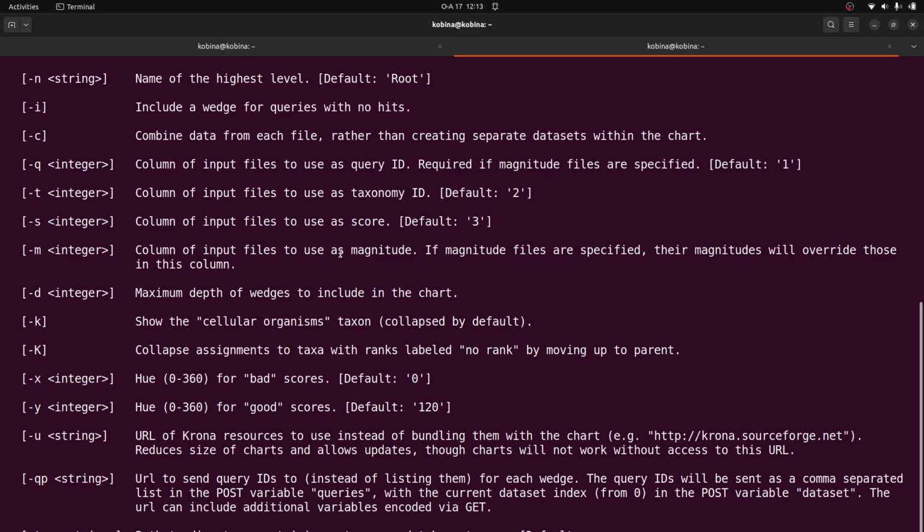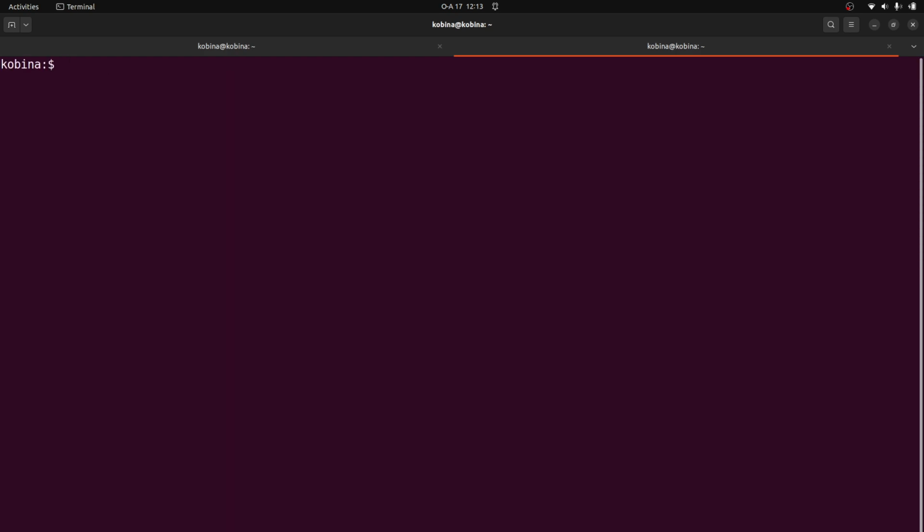All right. If you still have issues, you can also just get back to me, book a session, and we can resolve this. All right. So that's fine. So now everything is working perfectly. Perfect. So now that we have this, it's also important we test with an example data. That's what we are going to do now. So I have a data already prepared, which is a Kraken classification output. So what I would like us to do is to visualize that using KronaTools. All right, so that's what we are going to do next.